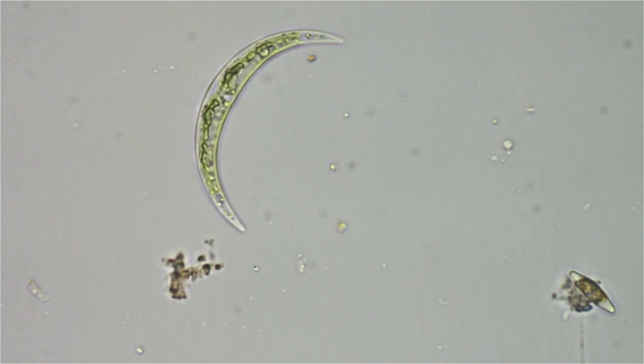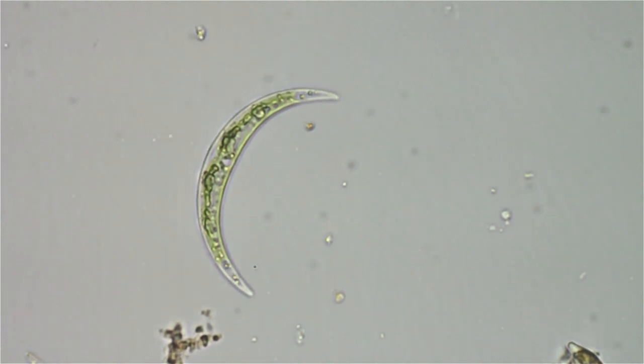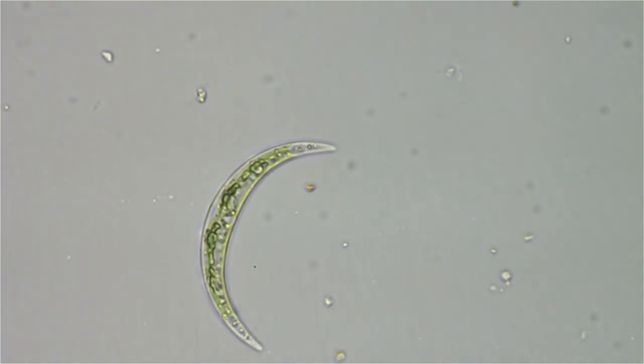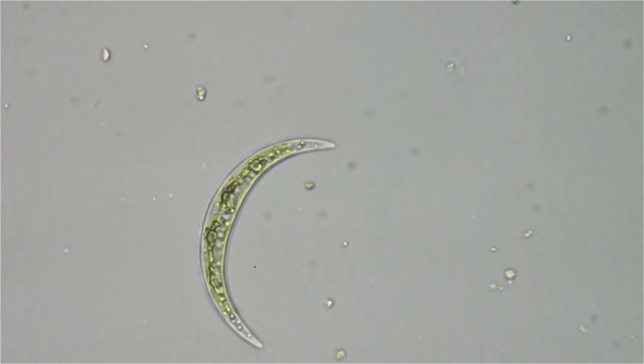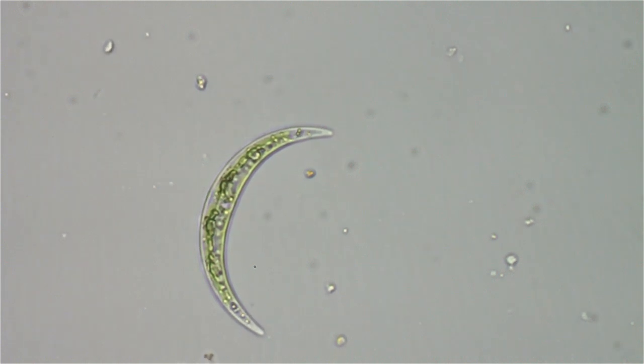This is the first living specimen of this I've seen. I've seen a number of them in other people's images, but I've never seen a video, and I had no idea they moved like this. Other desmids I've seen have moved a small amount — jiggles and wiggles — but nothing like this. This is just amazing to me.